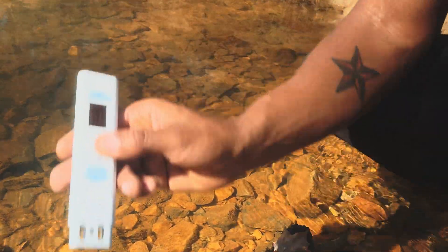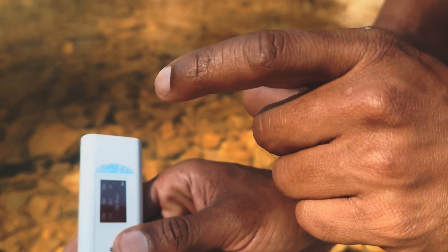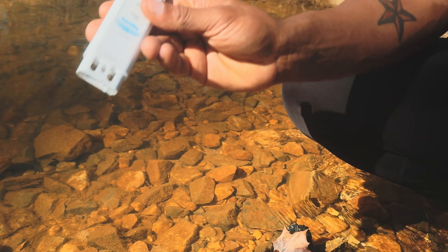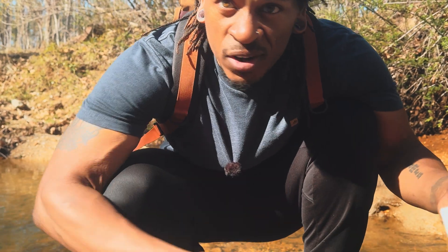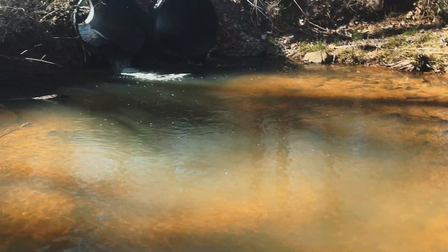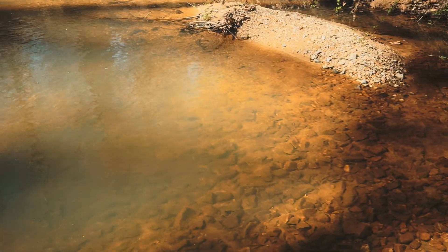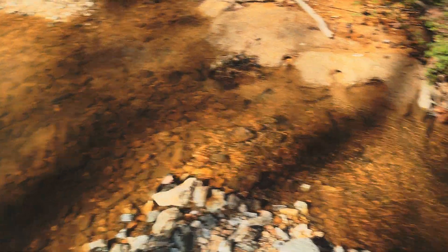38 — poor. The screen lights up red, yellow, or green. Green is excellent, yellow is average, and red is poor. So this is rated poor — it's no good, no bueno. You can see it — this is really clear and it's running. I don't know exactly where it comes from, but I do know that there's farmland, so that could affect it.